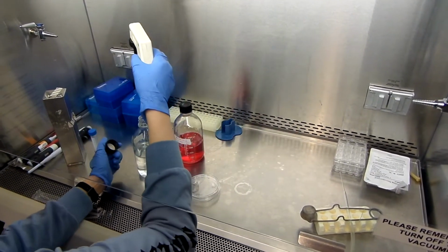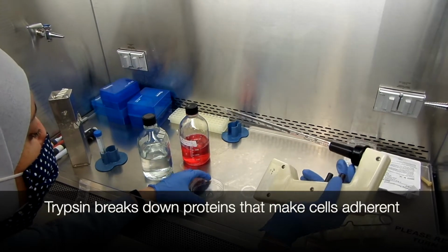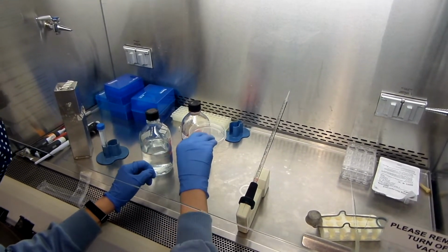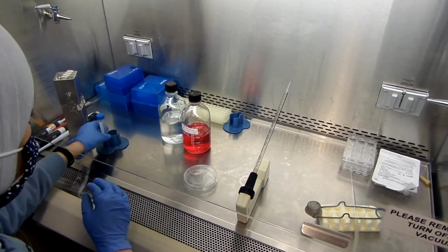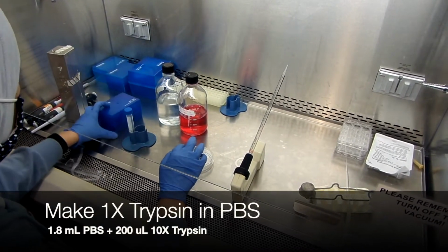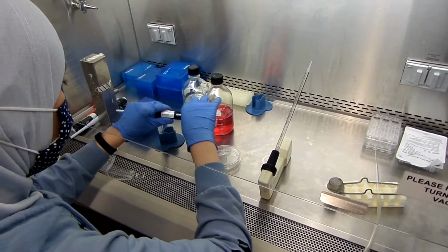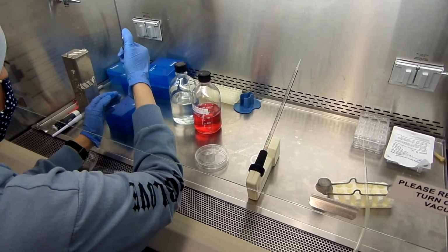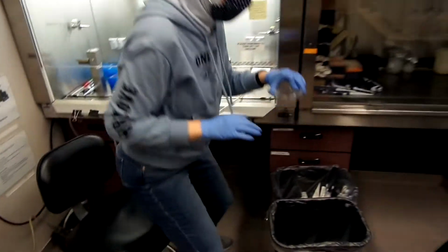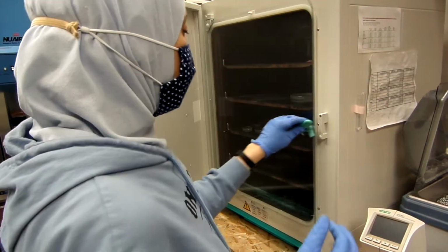And now I will add trypsin. Trypsin is an enzyme that breaks down proteins. And these proteins are the ones that keep the cells attached or adhered to this plate. So trypsin is a protease, and we buy it as 10x. So I'm diluting it: 1.8 ml PBS and 200 microliter trypsin. So I added 200 microliter into the dish that has 1.8 mL PBS. So the total is 2 mL, or a 1x dilution.